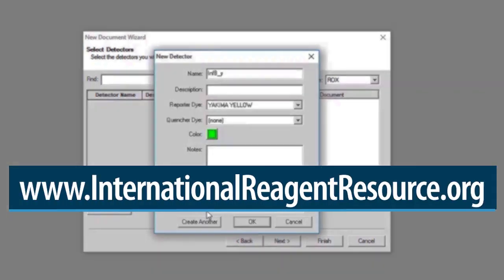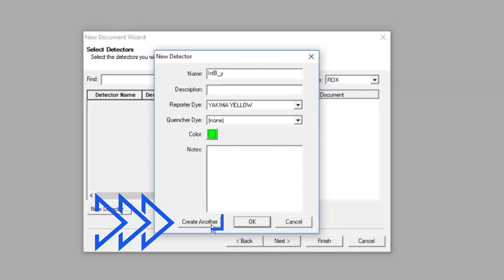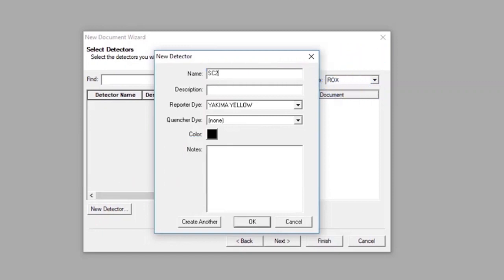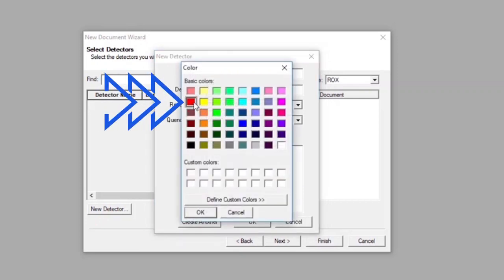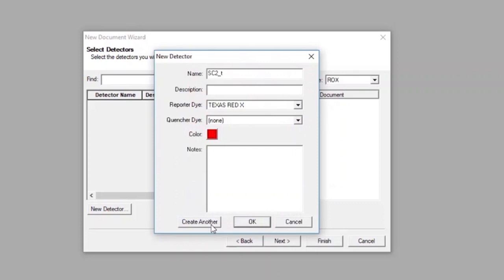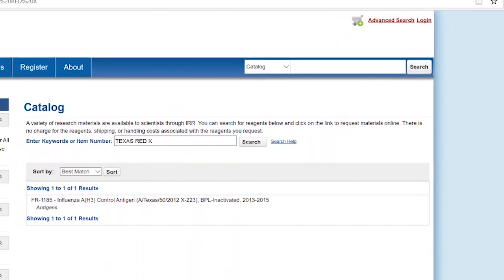Calibration probes for Yakima Yellow are available through the CDC International Reagent Resource webpage. To create the SARS-CoV-2 Texas Red X detector, type SC2_T into the Name box. Leave the Description box blank. Set the Reporter dye to Texas Red X, but leave the Quencher dye set to None. Select red as the color of the SC2_T detector indicator, and click OK. Note that your instruments may already have a Texas Red filter calibration installed; however, this is not the same as Texas Red X calibration. Calibration probes for Texas Red X are available through the CDC International Reagent Resource webpage.